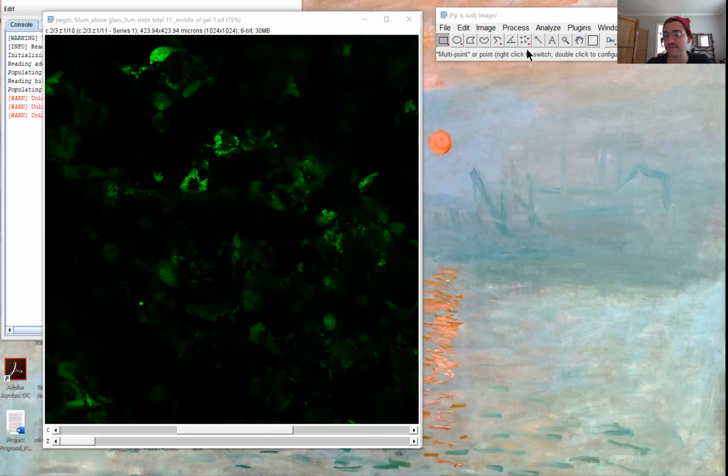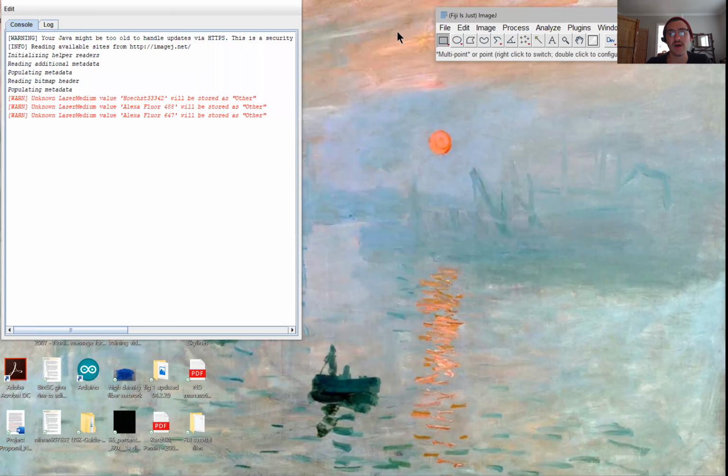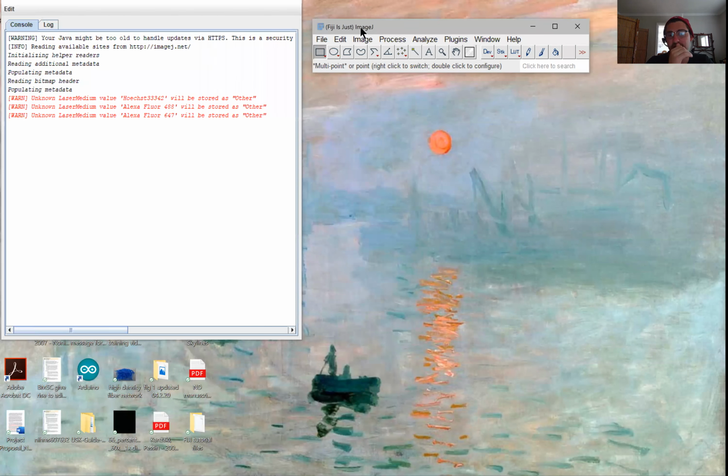So, yeah, that's pretty much it for the general tutorial. I hope this is not too hard for you guys. It's just a matter of playing around with it. Of course, Jen and I are going to be going over more advanced functions and how to make your picture look much cleaner without losing the main point of the picture, what you're supposed to get out of it, without biasing it.